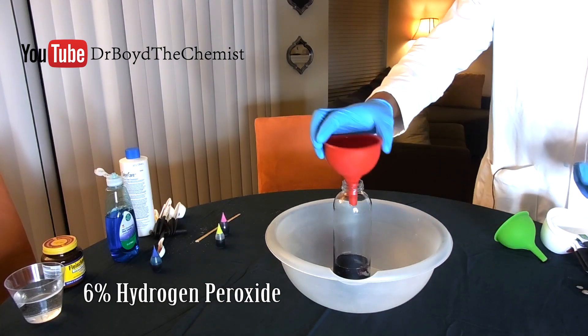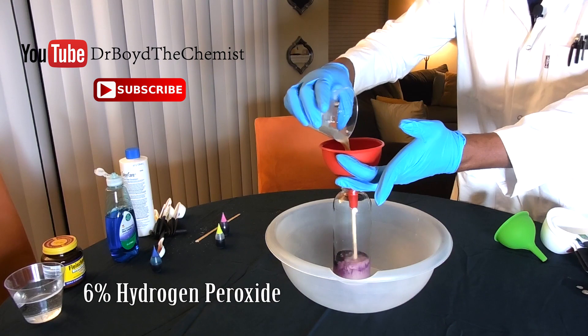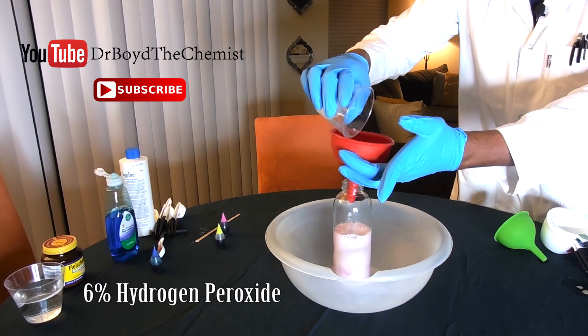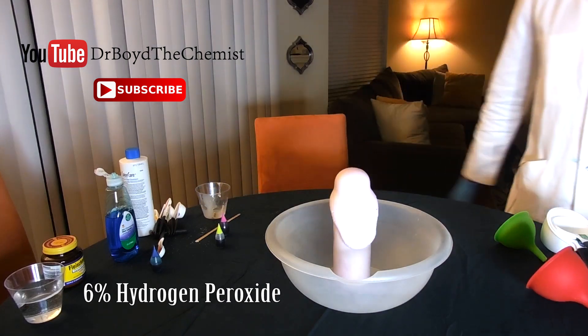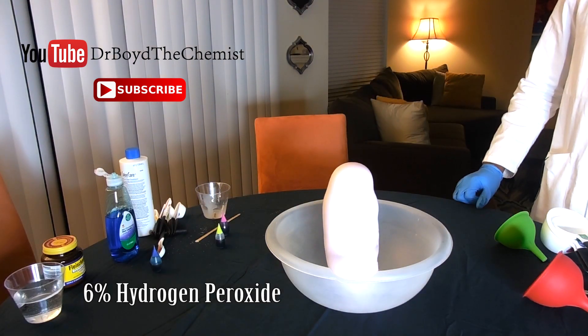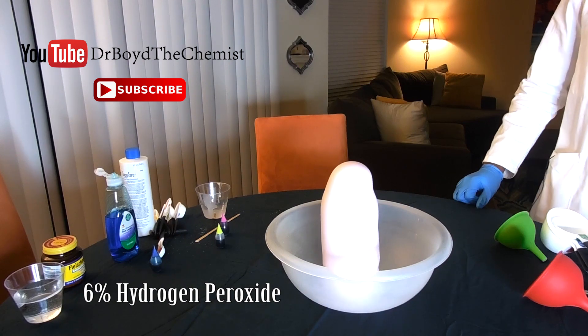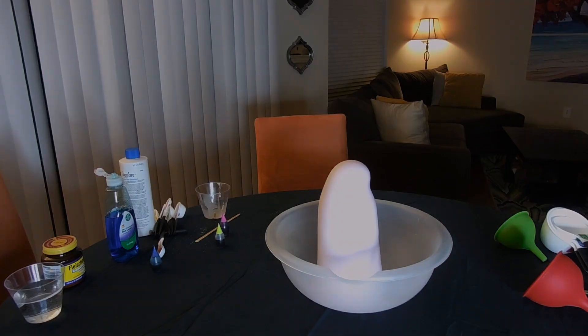As promised, I'm repeating the reaction with stronger hydrogen peroxide — starting with 6% peroxide, then repeating with 9% peroxide, before finishing with 12% peroxide. After seeing the reactions with stronger peroxides, go back and watch the 3% again. You should notice that the reaction goes faster as the peroxide gets stronger.